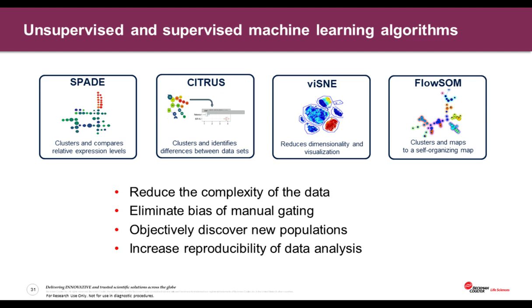And then ultimately, we objectively want to discover new populations, whether these new populations lead to biomarkers or whether they give us prognostic factors. This is the ultimate goal, so that we can understand how the therapeutic development is actually progressing. But ultimately, what we need to do is apply rigor in reagents, analysis, as well as acquisition to ensure that this is the case.